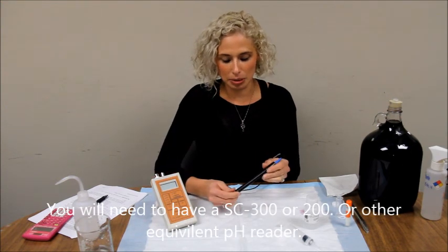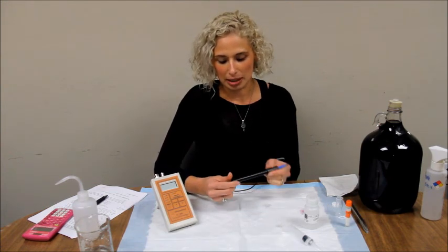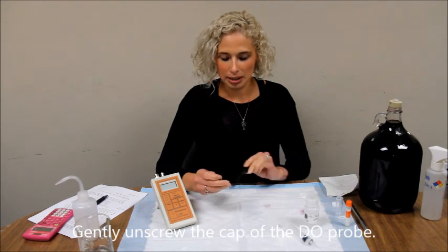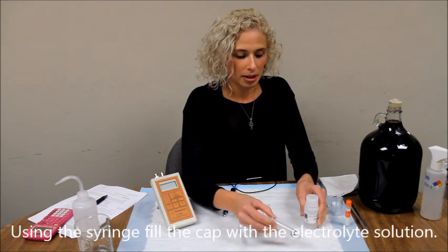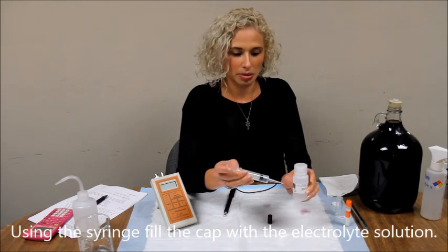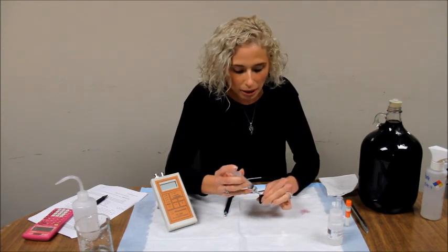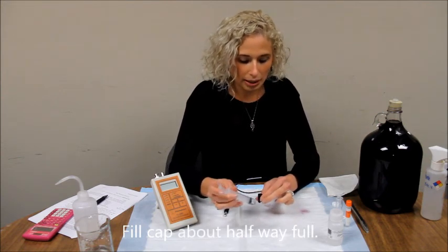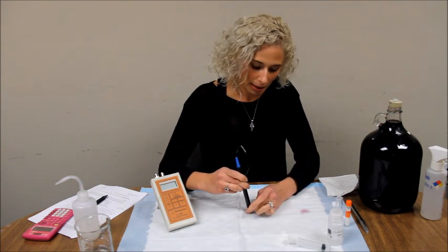The first time you use your DO probe you will need to fill the cap with the electrolyte solution. Gently unscrew the cap, exposing the anode, and fill the cap with the electrolyte solution. Fill the syringe with the solution and fill the cap about halfway full. Make sure you get out any air bubbles that might be in there. Gently screw on the cap again.